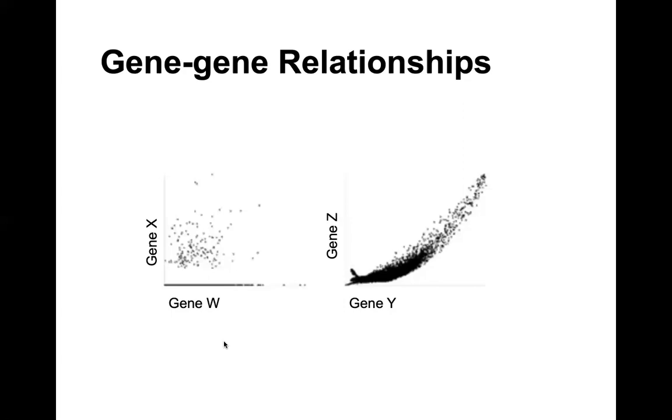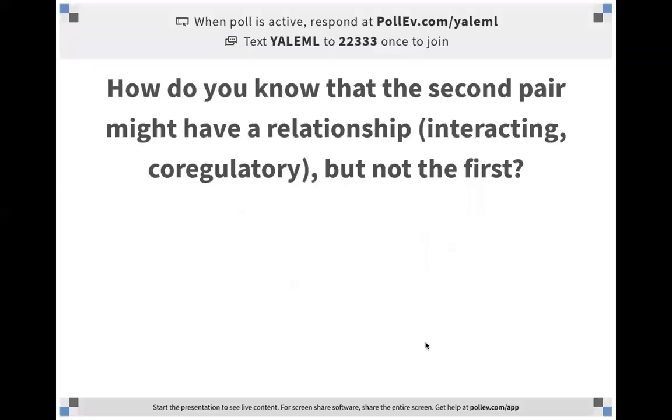Now, people have often told me that all the meaningful relationships in biology are linear. And you'll hear people in various fields saying that. To me, it seems very unlikely. The reason is because biological entities have heavy regulation. For example, you can only produce a certain amount of a gene after which it can be capped, which leads to nonlinearities. There's often a lot of feedback as well. So when we're really looking at single cell data, we often do tend to see nonlinear relationships like this one. And so I'll be talking about how to detect these kinds of nonlinear relationships.